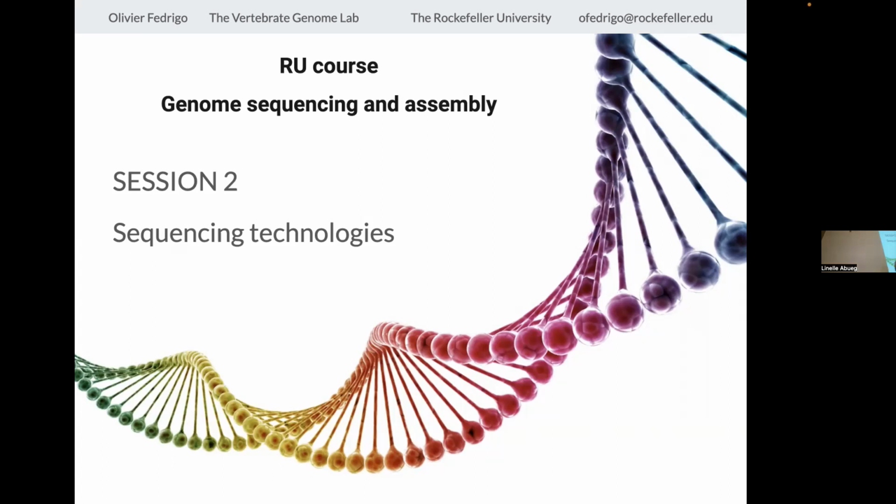In each capillary, your DNA oligos, your fragments that are labeled with different colors, migrate along the capillary. And they end with a color, right? A color for A, a color for C, G, or T. And the speed at which they reach the sensor is correlated to the length of the fragment. So you know exactly where this base is in the sequence.